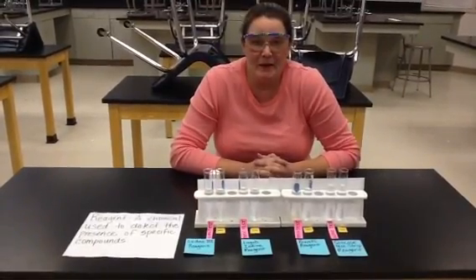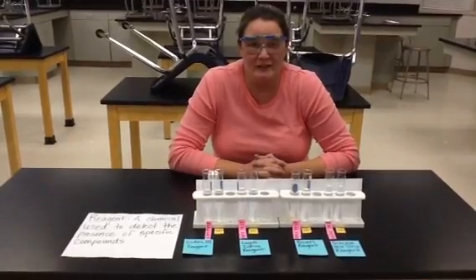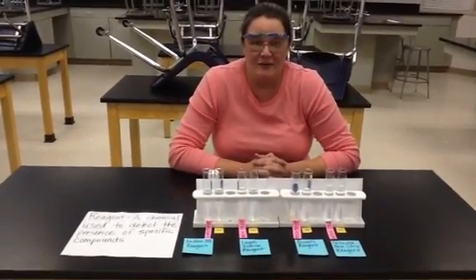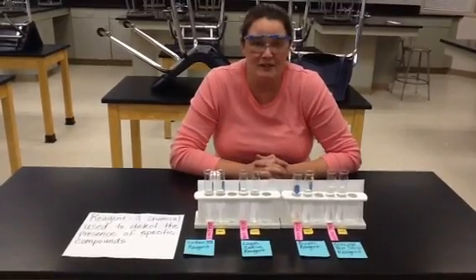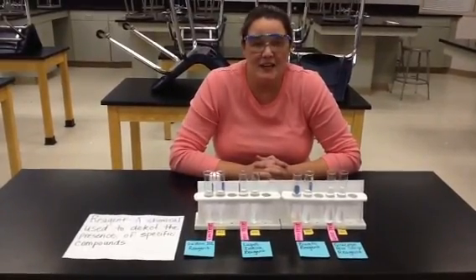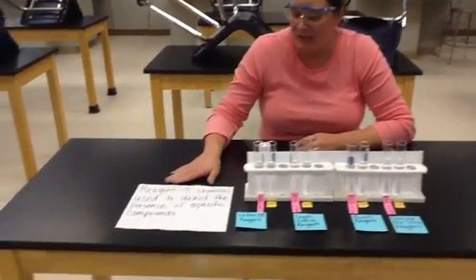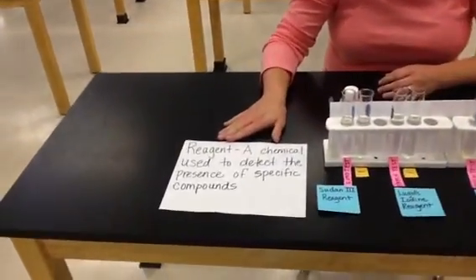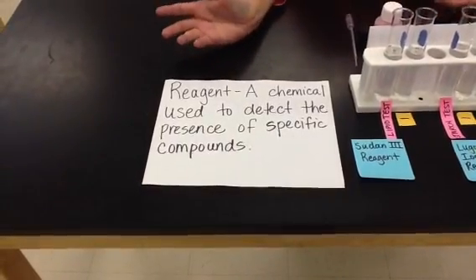This week we've been learning about organic compounds. They're those large macromolecules found in cells. And this coming week you're going to be doing a lab where you're going to be testing for the presence of those compounds. And you're going to use what is known as a reagent. A reagent is a chemical used to detect the presence of specific compounds. And we're going to be doing that in a solution.